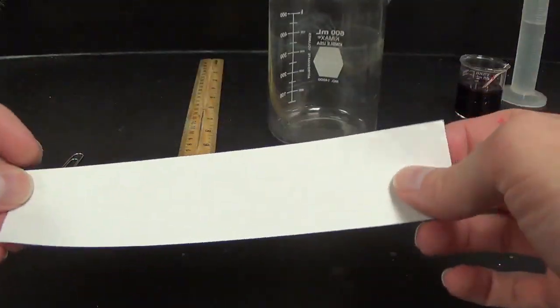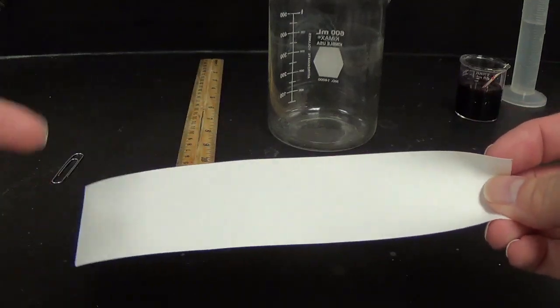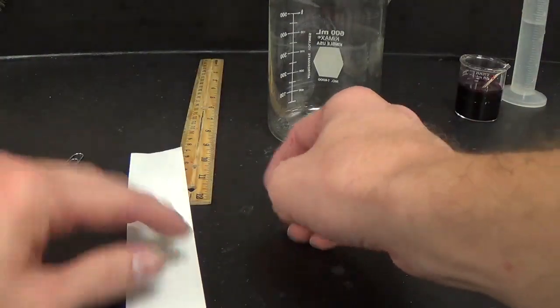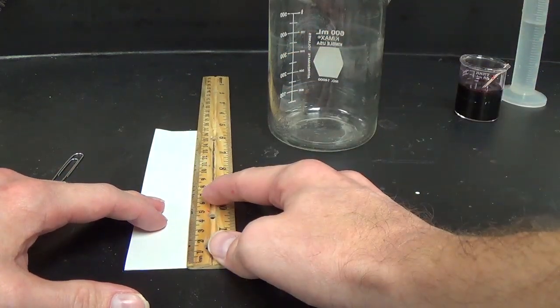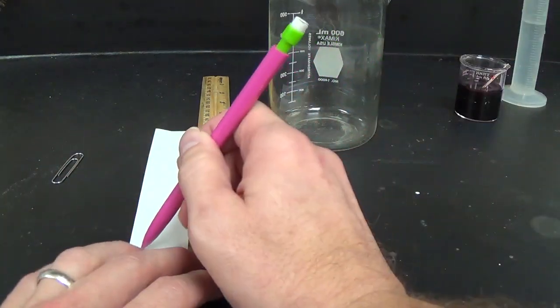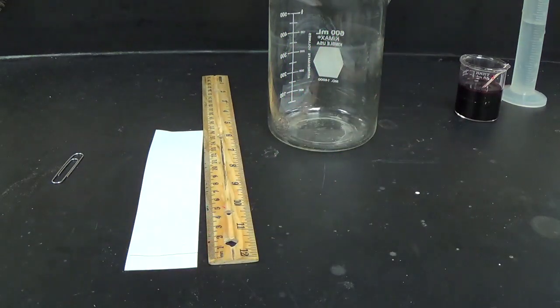But it is cut to a big strip for us, and sometimes the strips are wide, sometimes they're narrow, doesn't really matter. But I'm going to start by making a starting line, and I want my starting line to be about 1 centimeter from the bottom, and check this out, I'm using pencil.